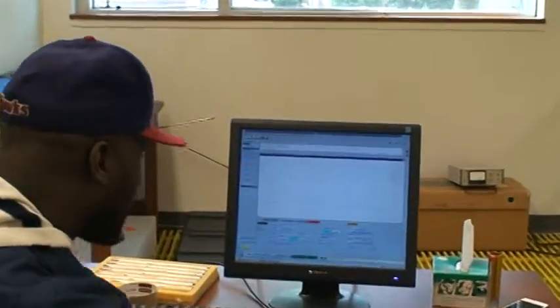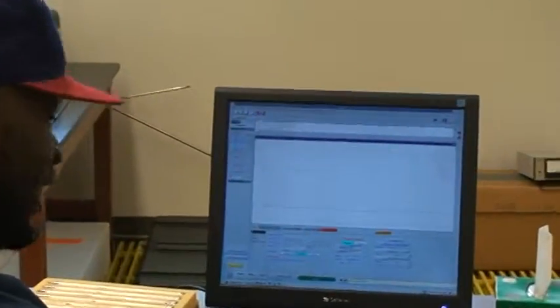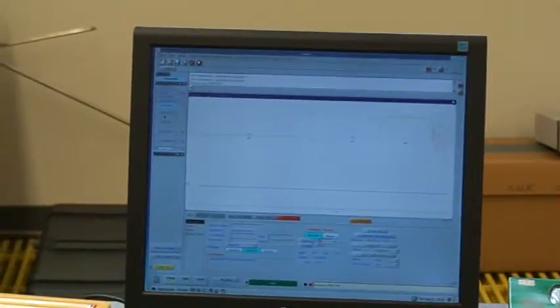So now, the thing that we want to do is pick our experiment parameters. The first thing you want to do is make sure you click proton, because what we're doing is proton NMR.